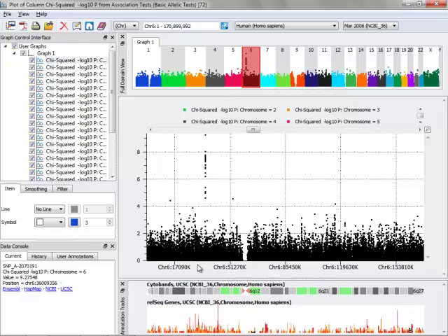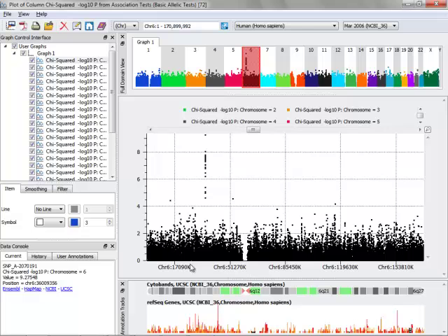So now you can see I've zoomed in to just chromosome 6 here, as designated by the cytoband track here on the bottom. I can go ahead and zoom in further by left-clicking and dragging on the x-axis. I'll do that a couple times.